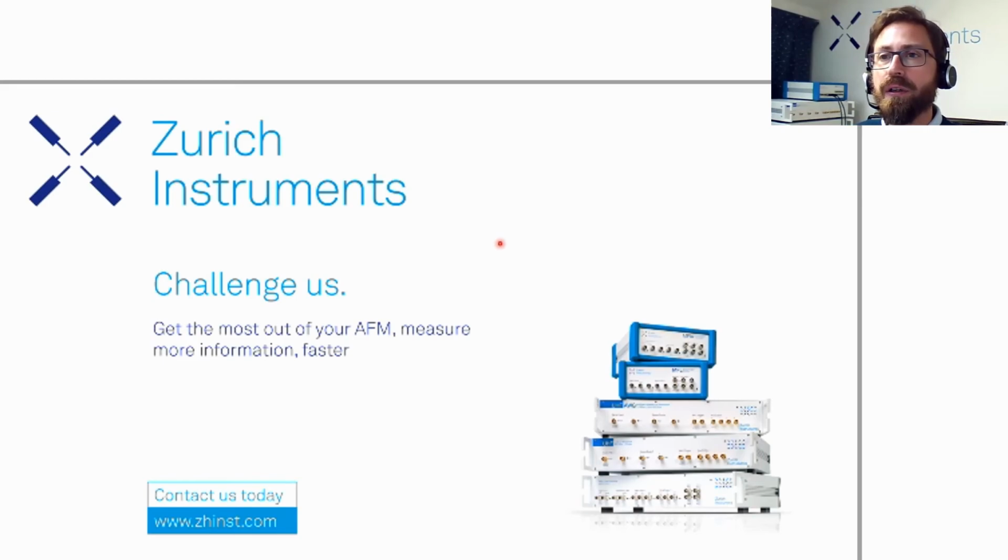Then I have another question on the first part. Can we also apply KPFM to other companies' microscopes such as Bruker? Yes, that's the idea behind all this.